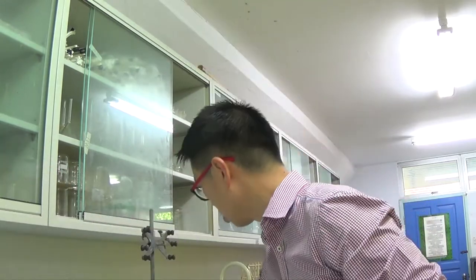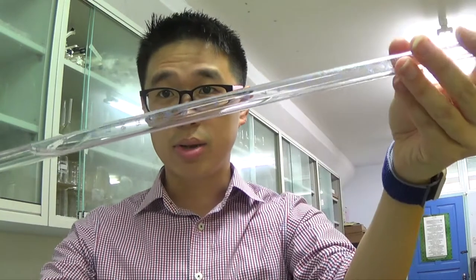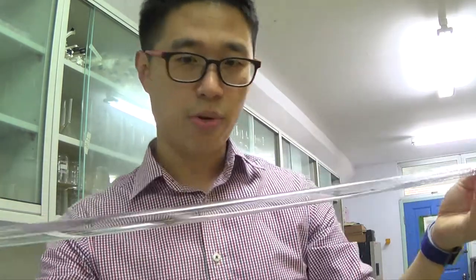Depending on whether you get it dry or a bit wet, you always have to wash it with a bit of distilled water. I should do this at the sink, but because I have the tap closed, I can just rinse it with distilled water. It's very important not to do this with tap water, because distilled water has no dissolved ions. Now I'll roll it so that it's washing the side of the burette with distilled water.